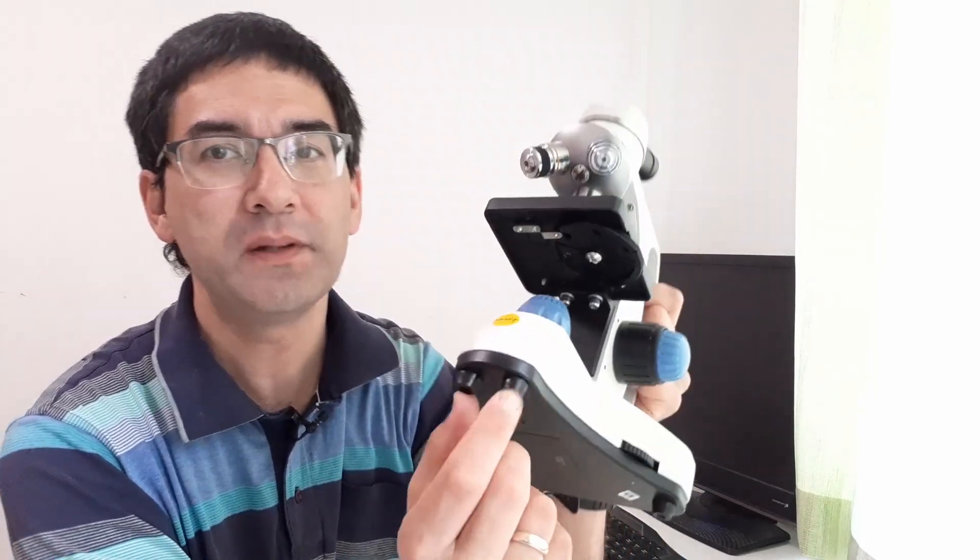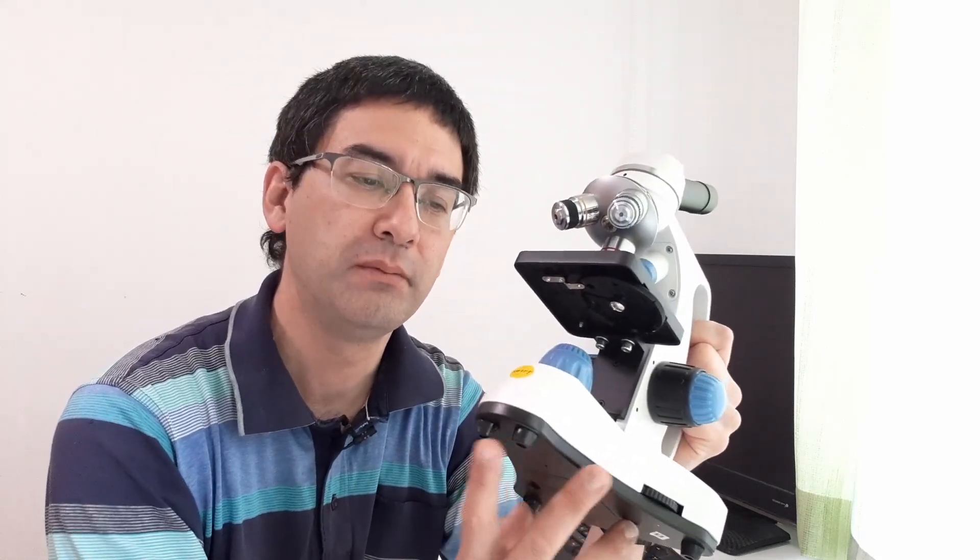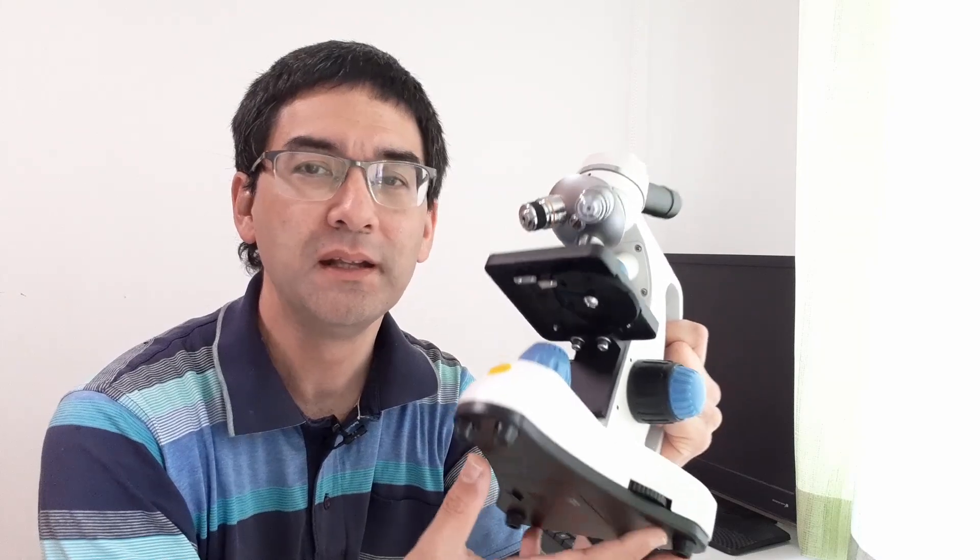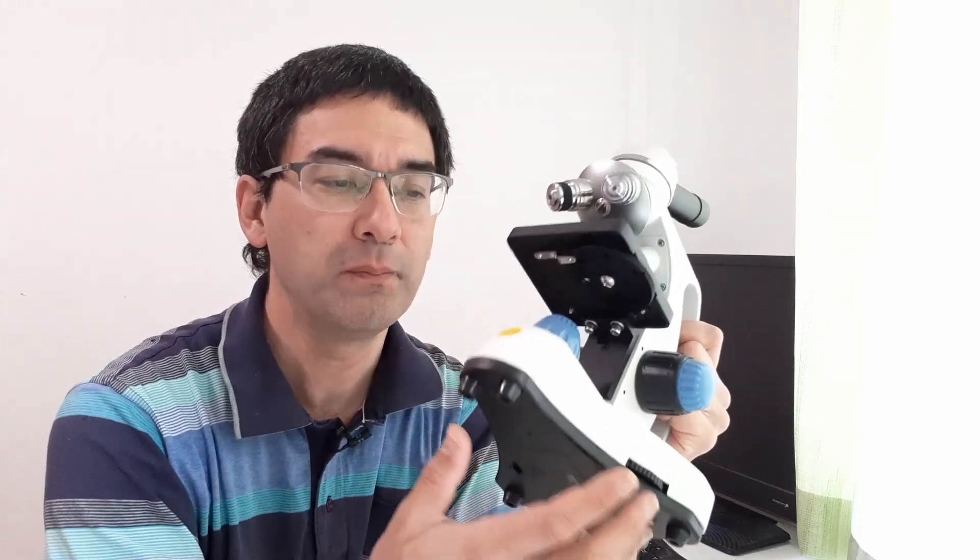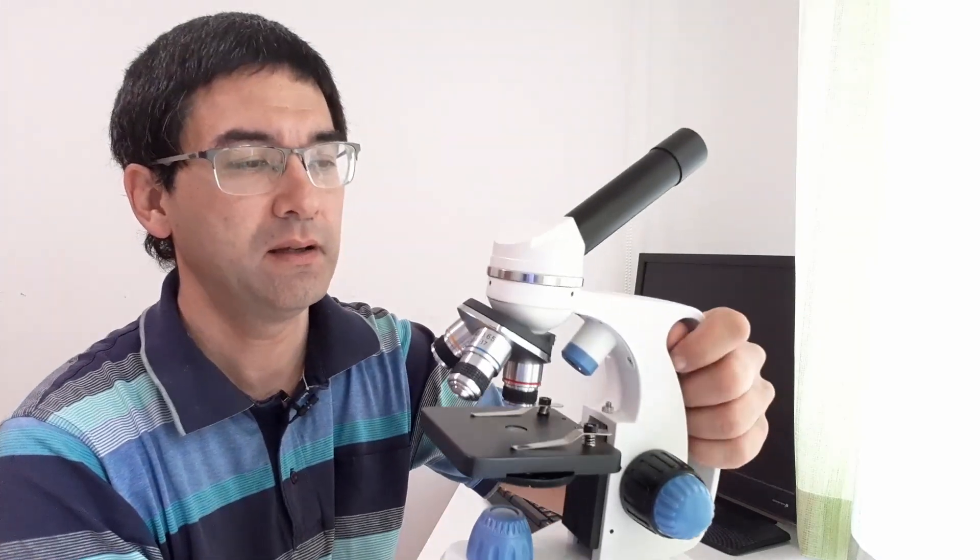Now the microscope itself has a triangular shape here. This is actually quite good because it gives it a little bit more stability than those microscopes that are square. So in that sense I kind of like the design.